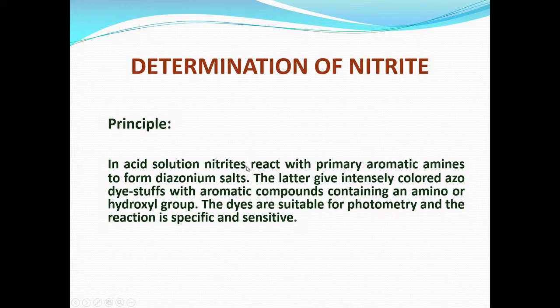It applies also to effluent monitoring. So, today I am going to discuss with you the determination of nitrite. Nitrite in general is a pollutant. Basically, it affects the heart and other tissues, especially with the formation of chemicals which will determine the functioning of the heart.